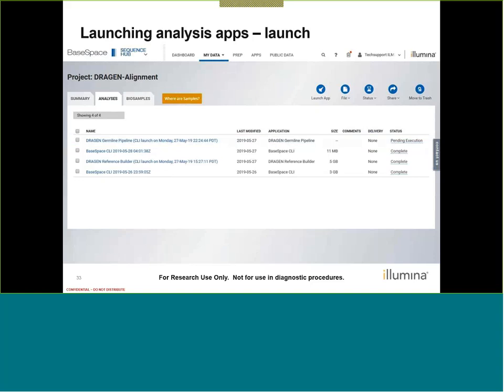So that's kind of a culmination of how we can upload non-FASTQ files that may be necessary for certain applications. This can apply to things like manifests and BED files. We can run applications using those after we find the file ID, and then we can pass the results from those applications into further downstream analyses, as we've done here.